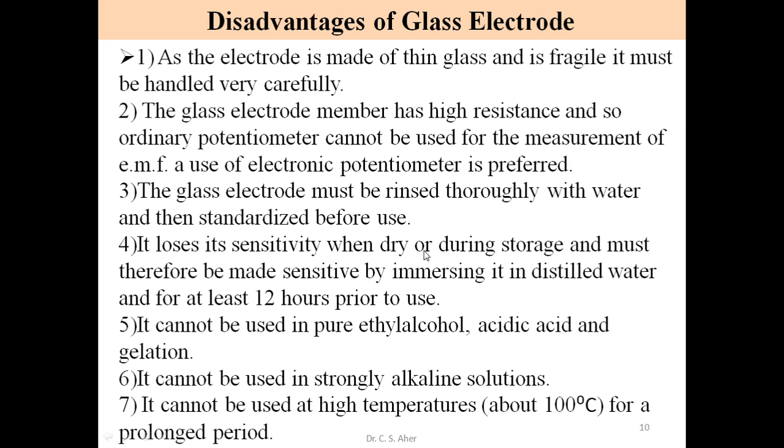It loses its sensitivity when dry or during storage. When this glass electrode is kept for a long time, at that time it is drying, though the 0.1 molar HCl solution is there, so the drying process occurs, and it must therefore be kept sensitive by immersing it in distilled water. For absorption of water we place this glass electrode in distilled water for at least 12 hours prior to use. So generally this is also a disadvantage. Generally we place this glass electrode in distilled water for storage also.